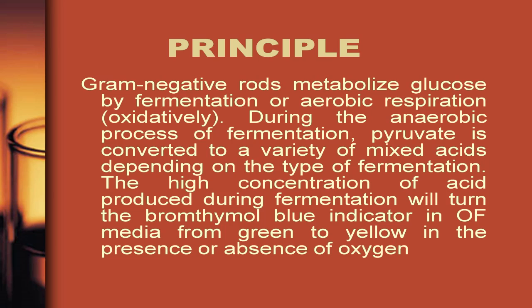Certain non-fermenting gram-negative bacteria metabolize glucose using aerobic respiration and therefore only produce a small amount of weak acid during glycolysis and the Krebs cycle. The decreased amount of peptone and increased amount of glucose facilitates the detection of weak acid thus produced. Dipotassium phosphate buffer is added to further promote acid detection.